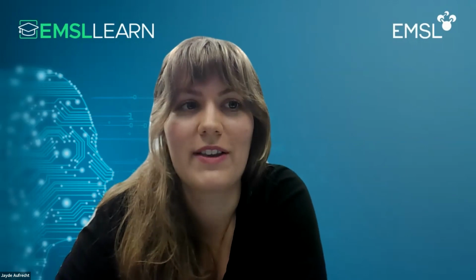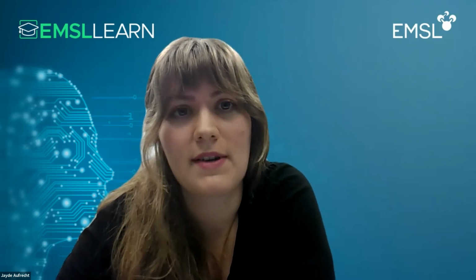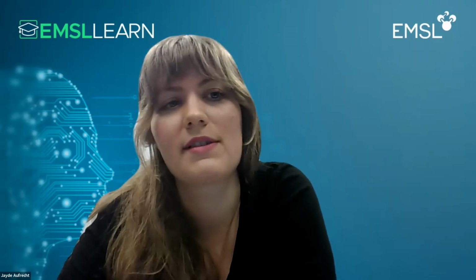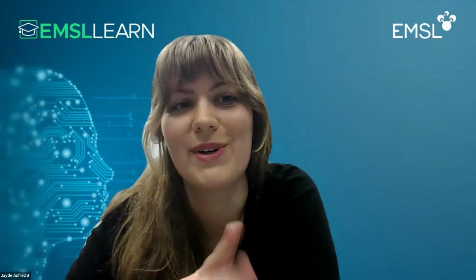All right. Amanda Stremecki is asking, can you inoculate rhizochips with mixed microbial cultures to simulate indigenous soil communities? Yeah, totally. I think that would be really cool, to look at more natural communities. It would limit the kind of optical imaging you could do, because none of those would be fluorescent, presumably. But if you were to look at the chemical imaging and compare that to the spatial genomics and transcriptomics, then that would help you understand who is where and doing what.